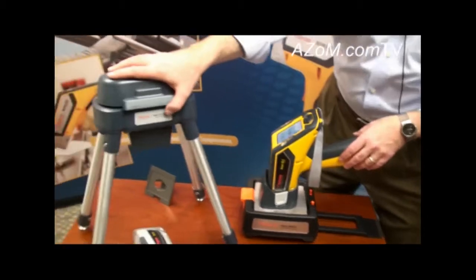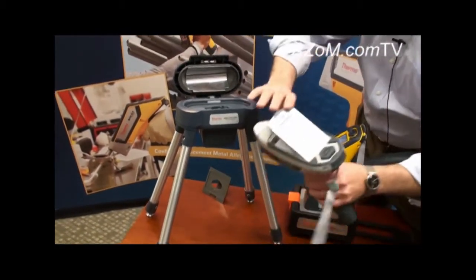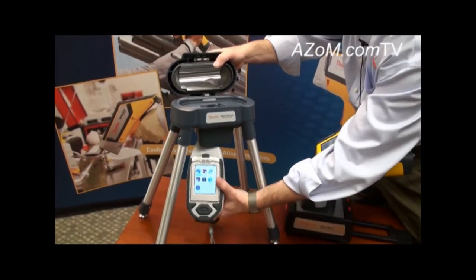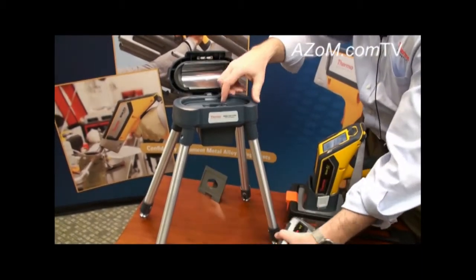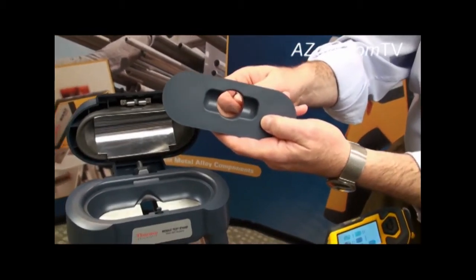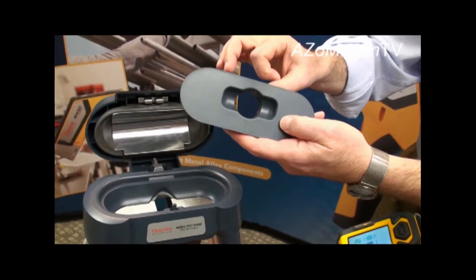The mobile test stand functions in a similar fashion, but in this case instead of the instrument pointing down, it clips right in underneath the analyzer. Both test stands have inserts that provide the ability to measure prepared or cupped samples.